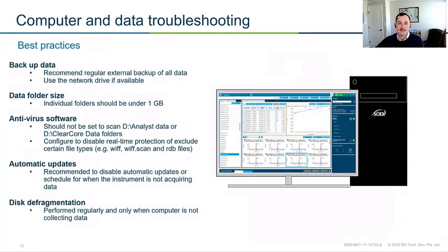And last but not least, when it comes to maintenance, there's also some computer maintenance. Without our computer, we can't run our LC, we can't run our mass spec, we can't analyze our data. It's a really key portion of this system. So just a few tips for making sure that you eliminate as much downtime as possible.